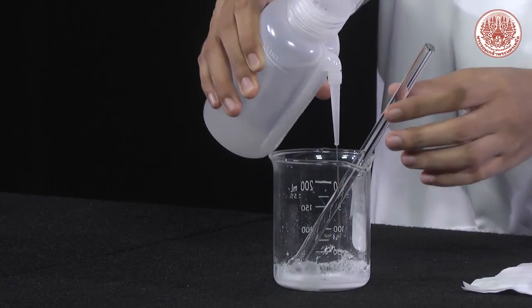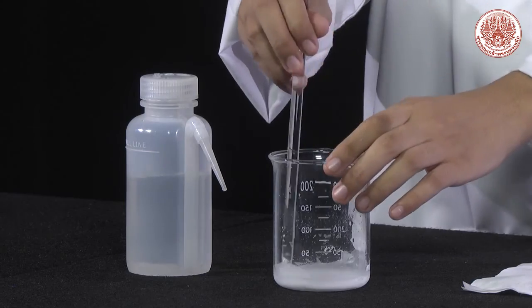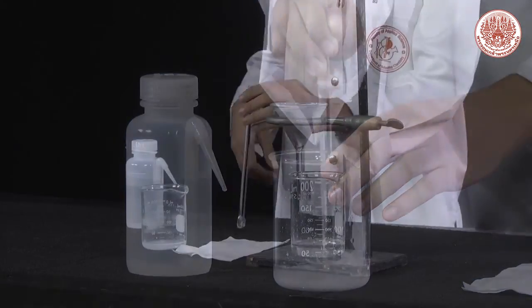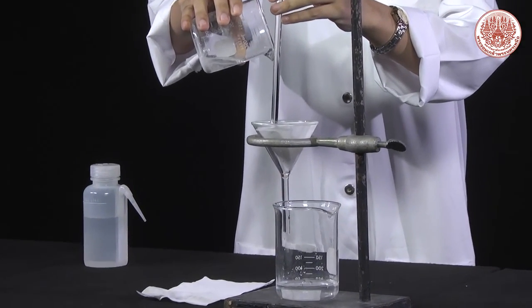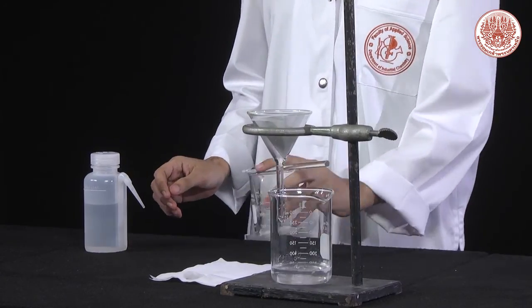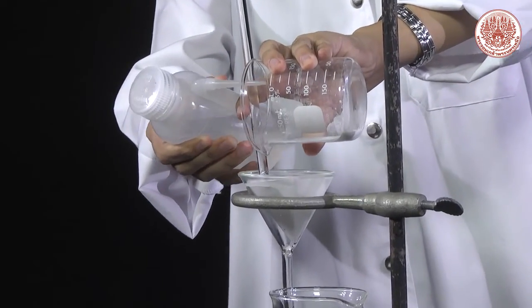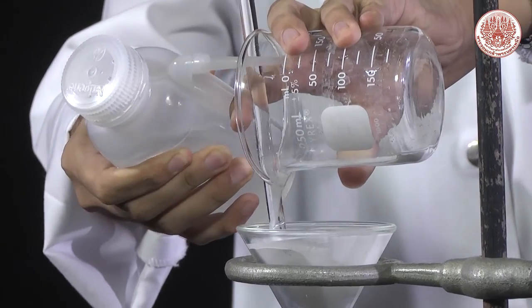When the liquid is almost drawn out, wash the precipitate using about 10 ml of water, twice. In each washing, decant the filtrate through the filter paper. The final step is transferring the white precipitate to the filter paper, assisted by a water jet from the wash bottle.